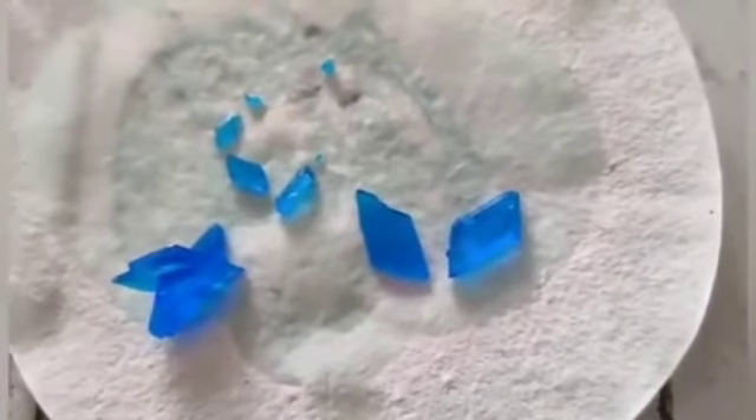These crystals have been formed, as you can see. They have a triclinic shape.